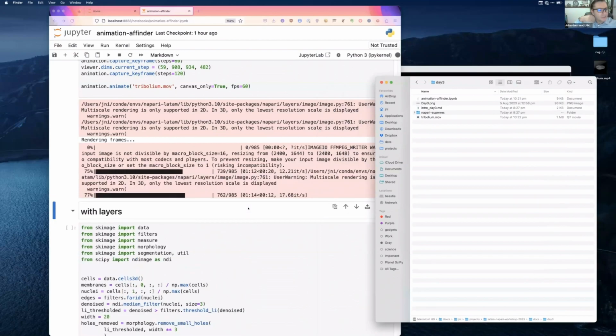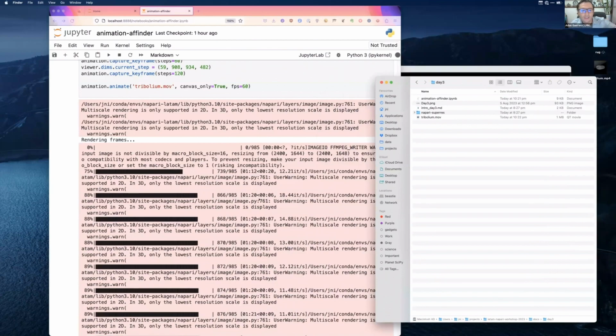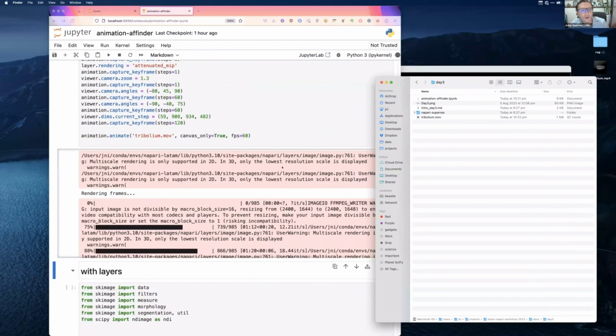I do have a question indeed. I realized that you are working there with Zarr files, and I wonder how the data is accessed when the Napari animation plugin is working.